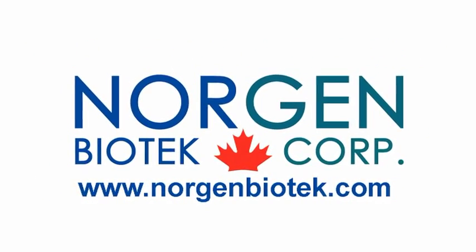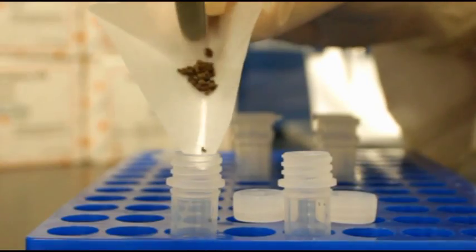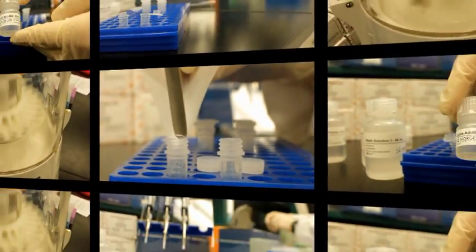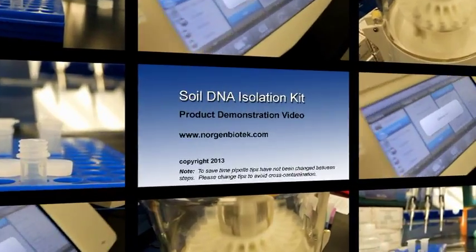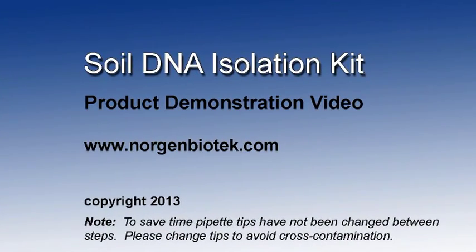This is a product demonstration video for the NorGen Soil DNA Isolation Kit. Please note that to save time, the centrifugation speeds have been omitted and fresh pipette tips have not been used for each step. Please read the entire protocol before beginning any soil DNA isolation.